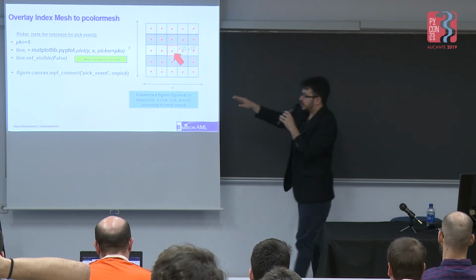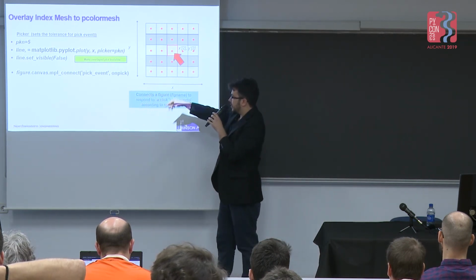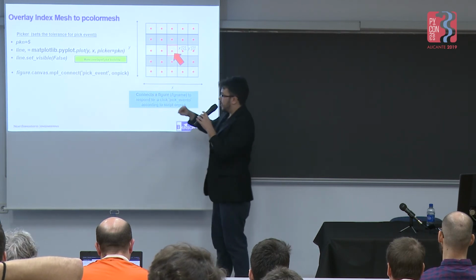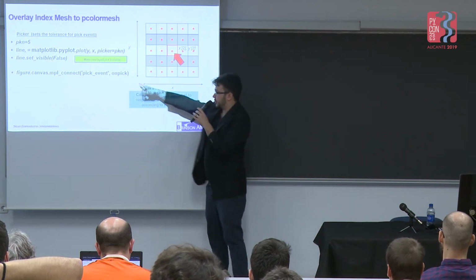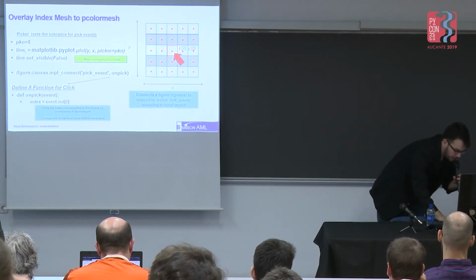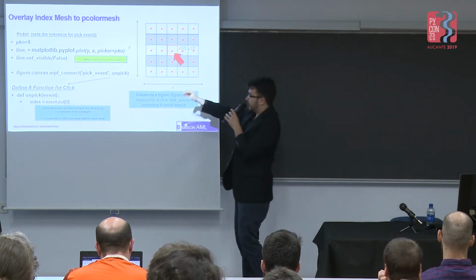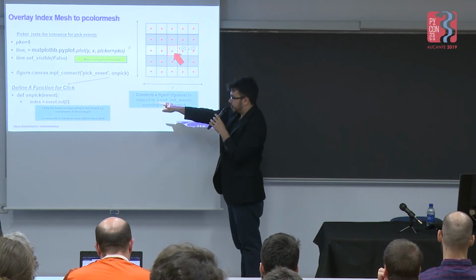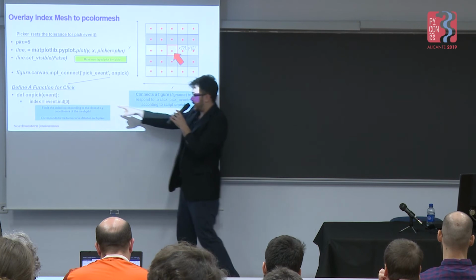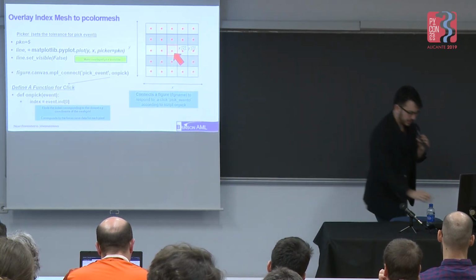And then I connect the figure using figure.canvas.mpl_connect and a pick event, which means respond to the click, and then on_pick, which is the name of a function that corresponds with that command. So I also have to define a function that will respond to this event, and in that function, I can call an index by using event.ind, and that will give me the index where that was clicked on the screen.